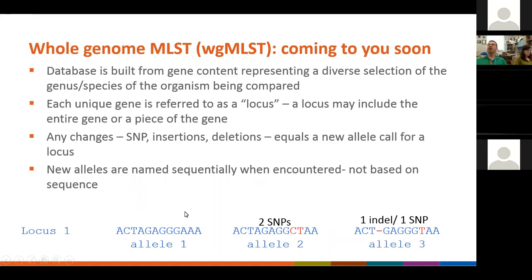On the other hand, if we talk about the whole genome MLST, here we don't look at all 3 to 6 million at once, but we take these data and parse it out into smaller subunits. And the subunits are called loci, obviously singular is locus. We can think of these as really different genes. So a 5 million nucleotide genome is 5,000 genes. So rather than analyzing all 5 million at once, we analyze it gene by gene, or locus by locus.